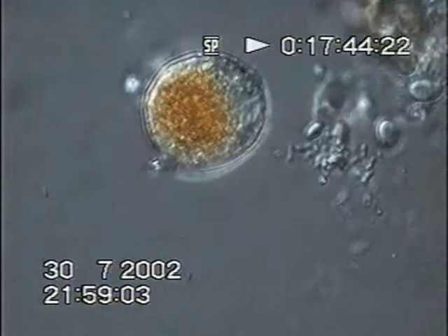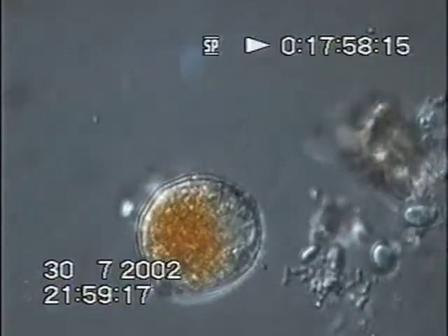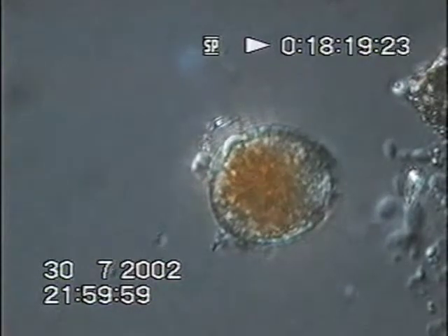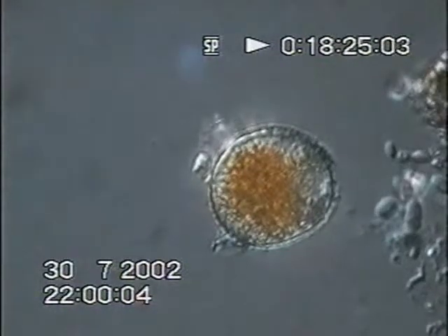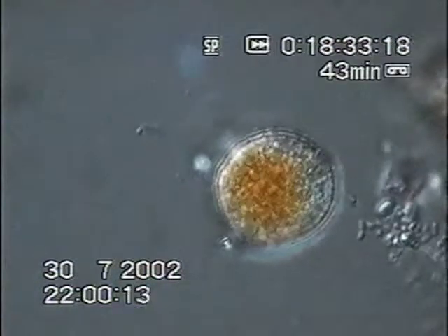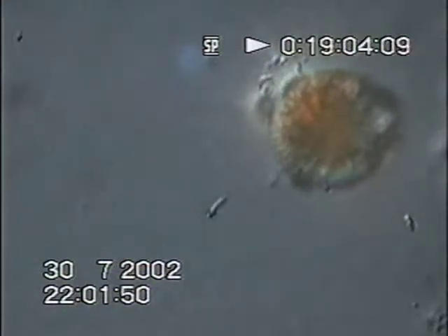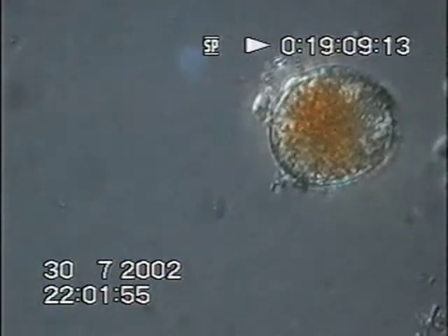Water times 400. Or nearby. What they're doing we don't quite know. And the interior of the pollen grain is exhibiting some kind of activity. Appear to be attacking the pollen grain. Very active organism there. And something attached to the pollen grain.